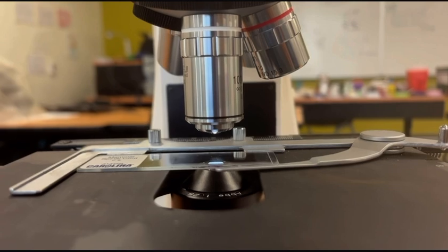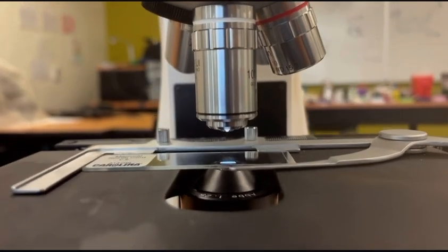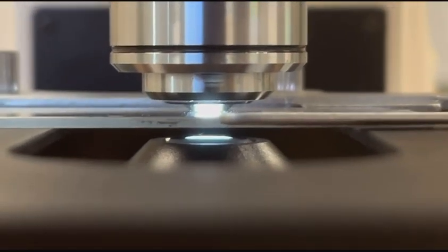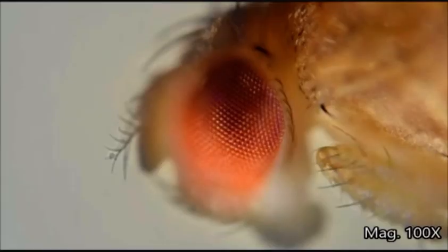So when you're using immersion media like oil or glycerol, you're going to have a much smaller working distance. Keep in mind, a smaller working distance will lead you to having a smaller depth of field, and that can impact you if you're working with thick specimens.